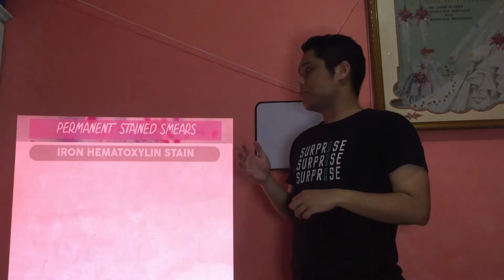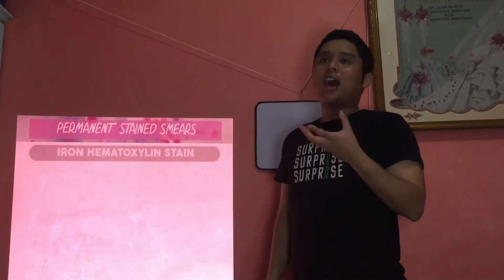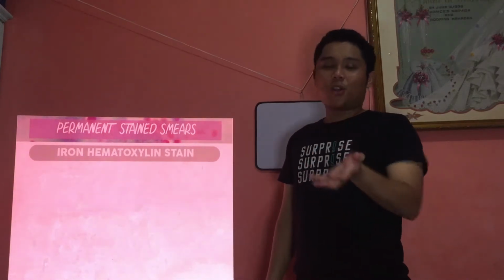For this lecture, what we're going to talk about is the iron hematoxylin stain and our lab procedure, our lab activity in our class, under normal circumstances.